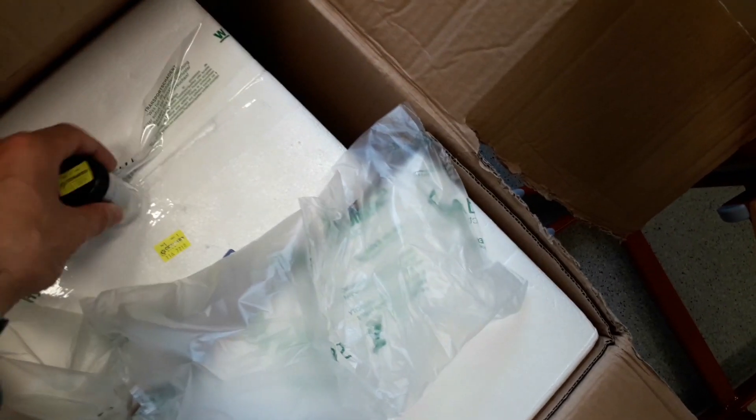Hi, hello and welcome. Microbe Hunter here. We are now going to buy approximately 20 microscopes for our school, for educational use. Because this is quite a bit of an investment, we decided we're going to first contact the microscope retailer and get two sample microscopes that we can test. They arrived today, and what I'm going to do now is unpack them. I'm going to show you which microscopes we're going to look at in more detail, and then the team of teachers will decide which one to choose.